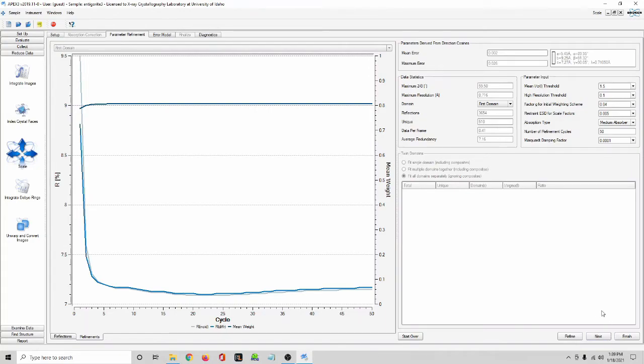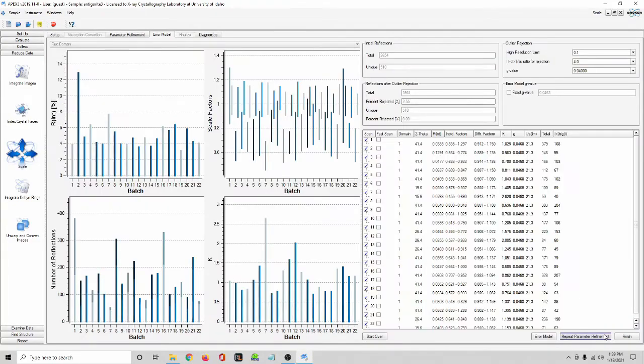You can hardly get a crystallite that doesn't have a twin domain, and the overlapping reflections on the sublattice peaks create this discrepancy in the R internal. So we'll just have to deal with that. But this isn't that bad. It's just not as good as a normal mineral structure would be. So we'll just deal with that.